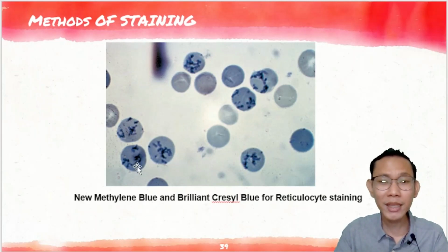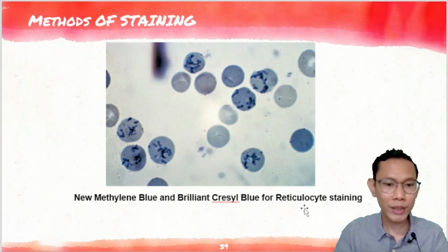Please remember this because these are very common na mga staining na ginagamit natin, not only in histopathology but also in other subjects such as your hematology. So, Doc, ano po bang ginagamit? Bakit po tayo? Ano po bang reticulocyte count? Ano po ba yung reticulocyte staining?